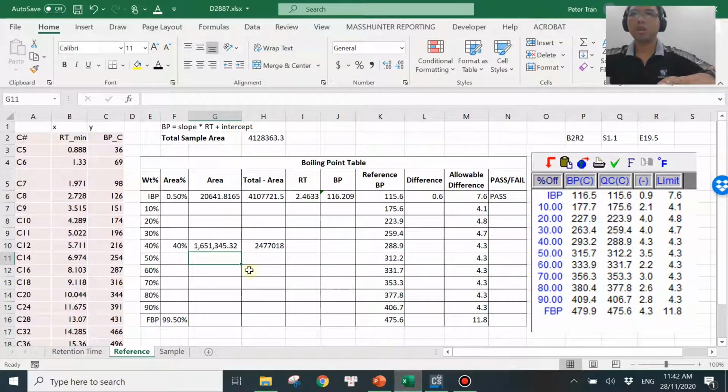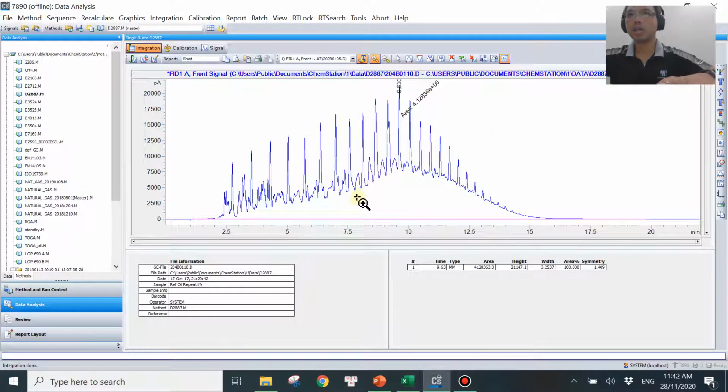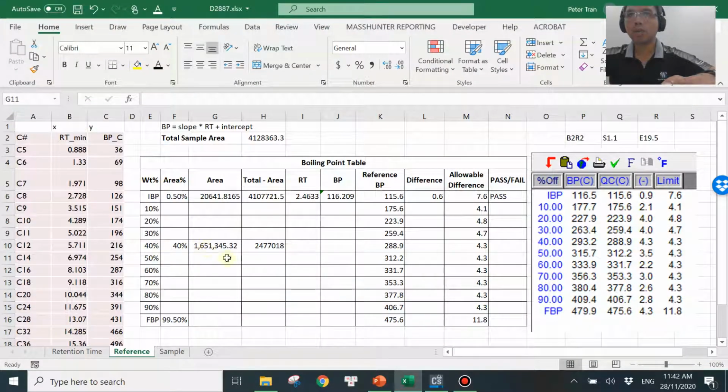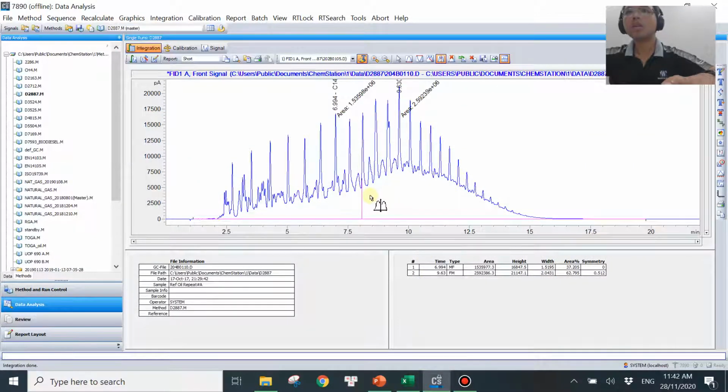So what you need to do over here, again, 1.6, we get about 40%. So 40% probably somewhere here. So let's try to click somewhere here and see what we get. Okay, we're close. We get 1.5 million over here. And actually, we need to get a little bit more. So sometimes you don't need to remove the last one over here. Otherwise, because you don't know where you stopped just now, you can keep this one, then you can add one more, something like this.